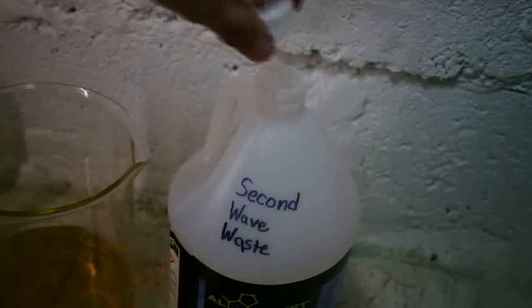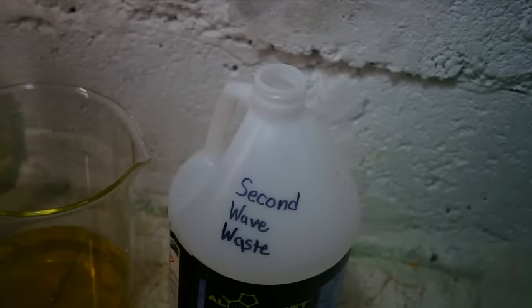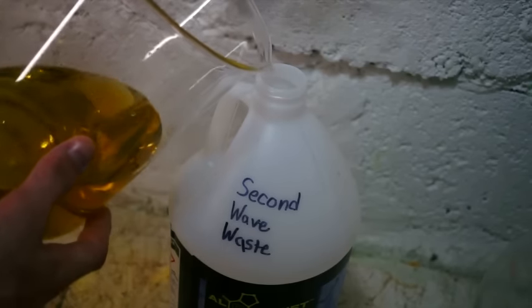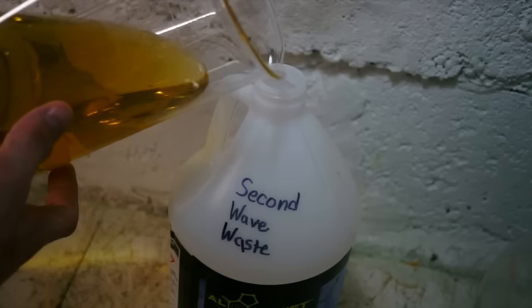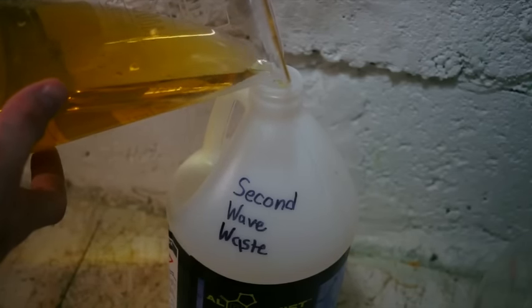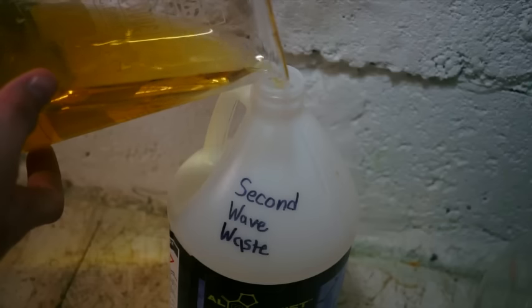Next, we will pour the remaining wash solution into a container for second round waste. I like to keep them separate from the first round because it's easier to process with less metal dissolved in the acid.